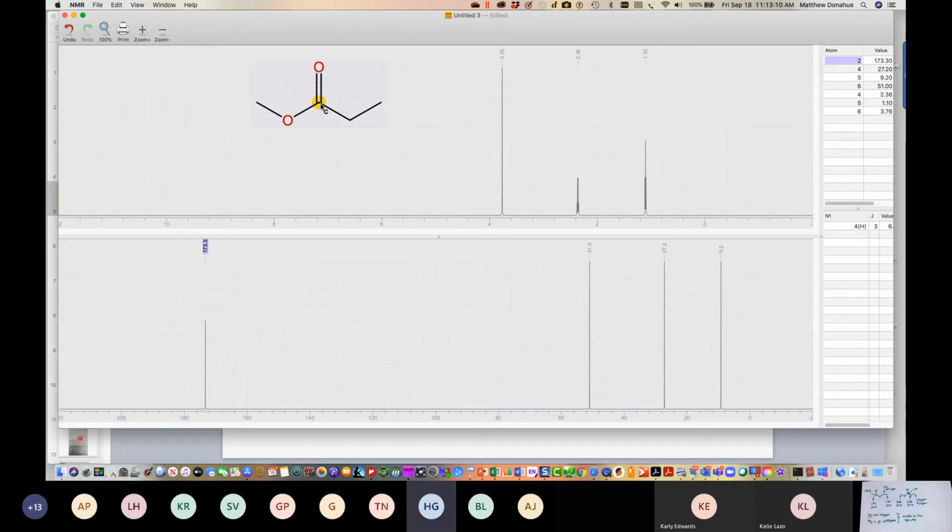Is that just for what I showed, or for all proton NMRs? This is for every single one. This data will always occur in these regions. Remember, like IR, when you were reading it, was 4,000 to 400 reciprocal centimeters. That's how the spectra always look.